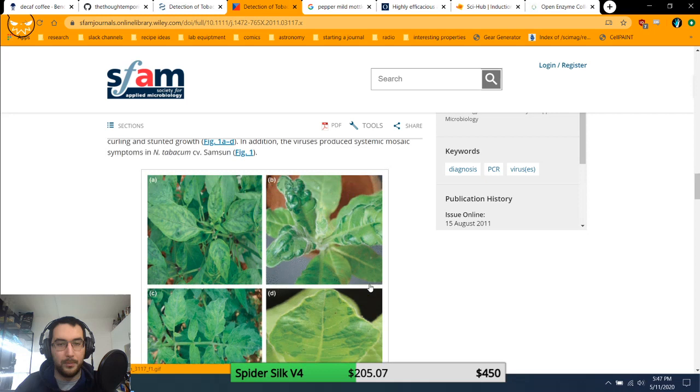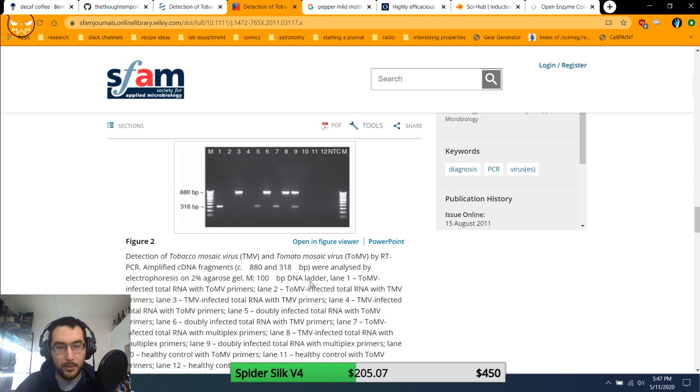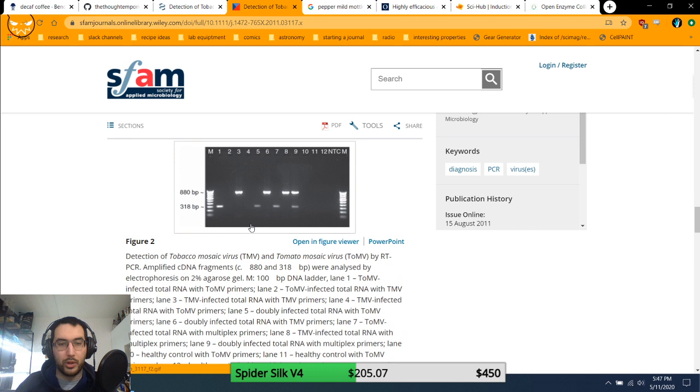Okay, cool. So this would be the reaction. This is what should happen. So you can see that there's a nice band here. I believe three... Okay. What do we got? Okay, lane 4, tobacco mosaic virus infected, total RNA. So yeah, okay, doubly infected, it's lane 5, lane 6 with, okay, here, yes, good, perfect, that's what I thought.